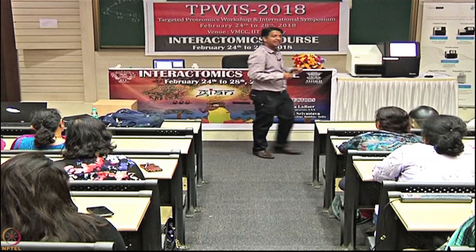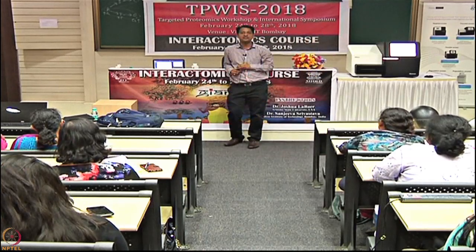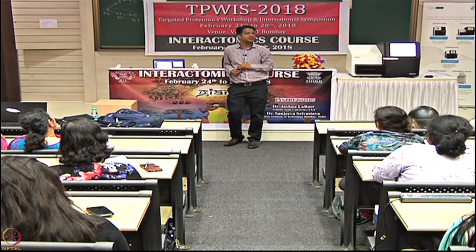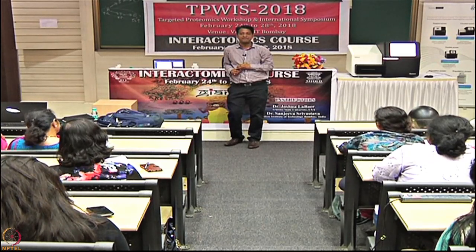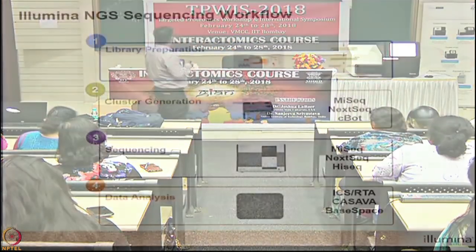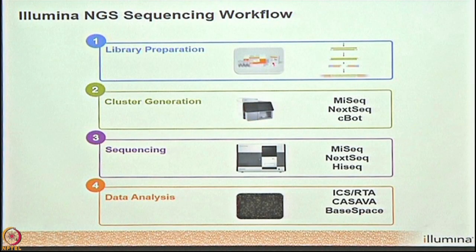No. So with the help of NGS technologies, you can sequence 50 human genomes in a span of 48 hours. How many? 50 human genomes in a span of 48 hours. So the key idea remains the same. The principle remains the same. What we do is, let's say you have this human genome. Initially we fragment this human genome into very small fragments. And just like cloning, we don't need cloning at all in the case of NGS.